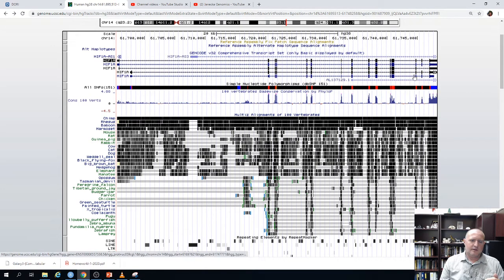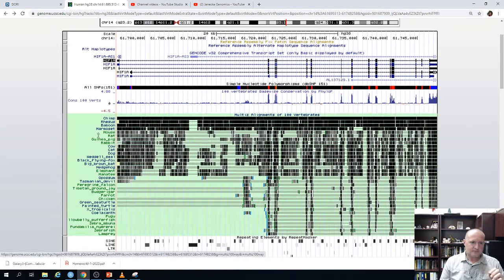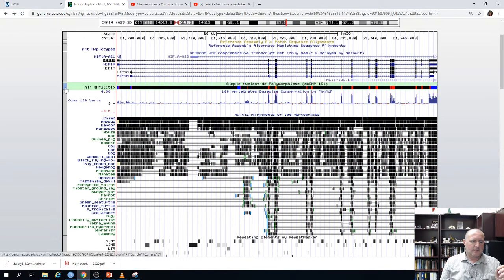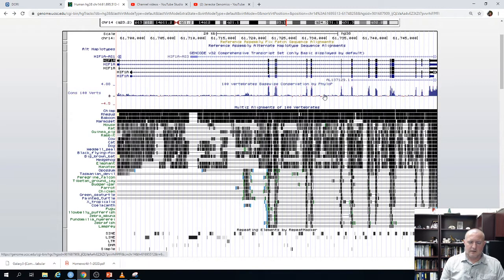The untranslated region SNPs are shown in that untranslated region of the transcripts. We can also completely hide a track — just remove it entirely. If we click hide, it disappears.